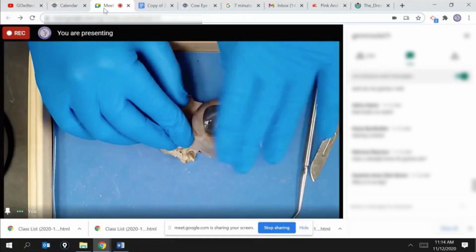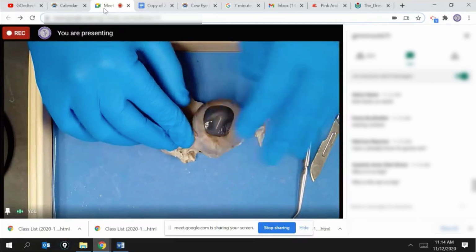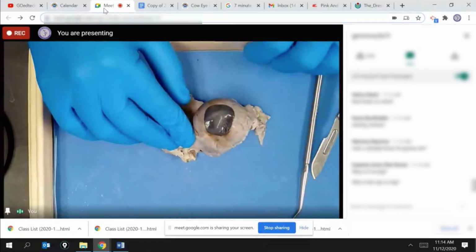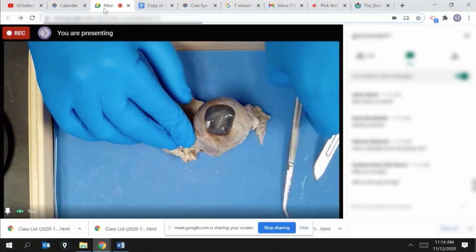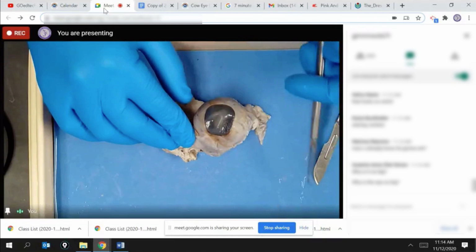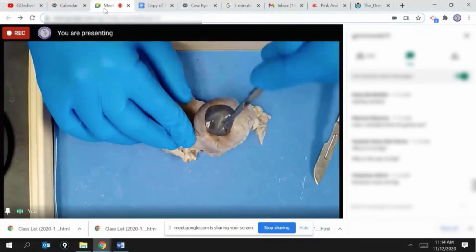It has this protective piece over the top of it. Remember that we read the article that talks about how light will refract as it comes in. That's the cornea that helps with that refraction, or the bending of the light. It's also a protective area. So you want to make sure that this is well taken care of.